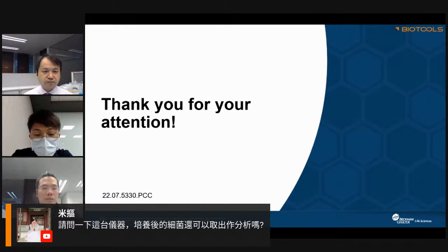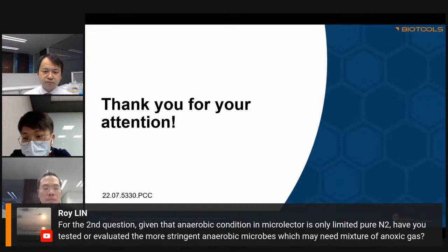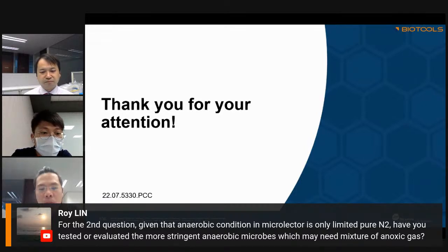Okay, thank you. I have another question. Given that the anaerobic condition in the microreactor is only limited to pure N2, have you tested or evaluated more strictly anaerobic microbes which may need a mixture of gases? It's quite a long question.